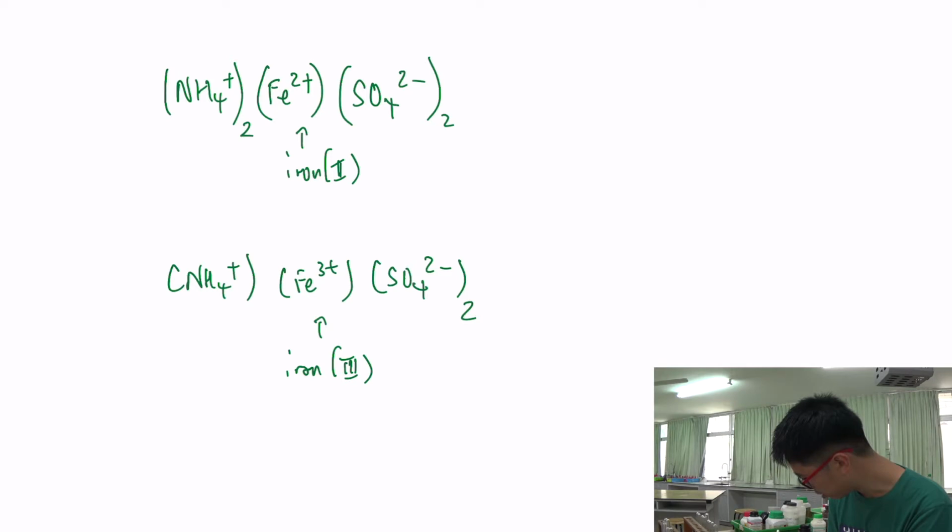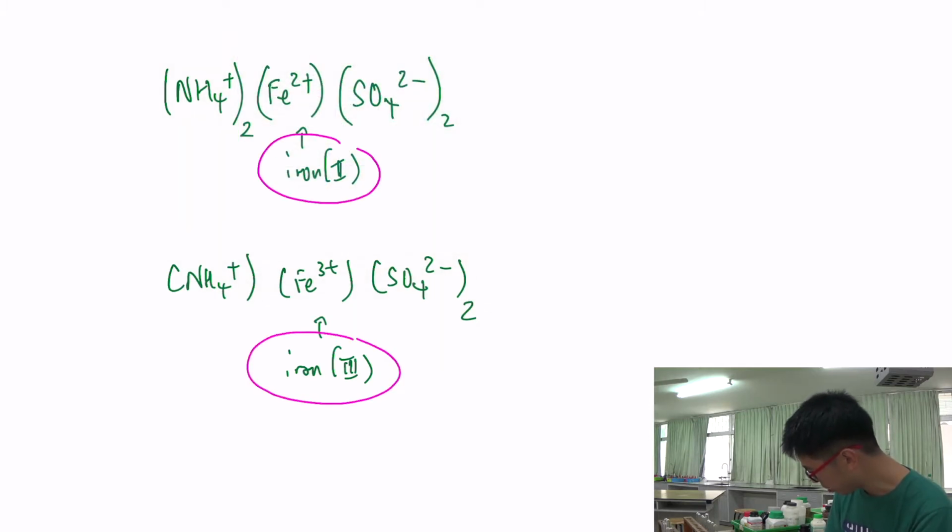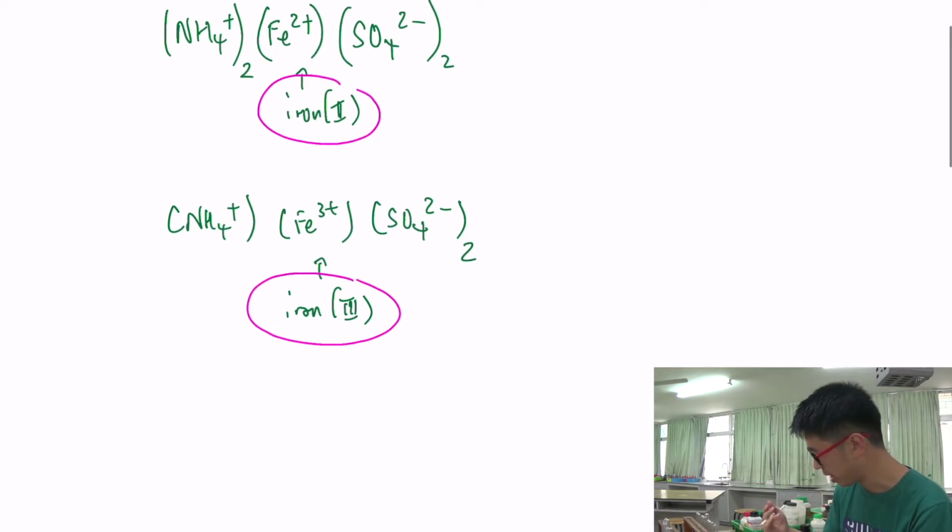This is iron 3. My focus in this tutorial video is not to think about the ammonium ions, which I already went about identifying in my other tutorial video. Of course, my focus here is also not on the anions, which I also identified in the other video. My focus here is on the cations; the overall framework of this tutorial video is really to talk about the cations present.